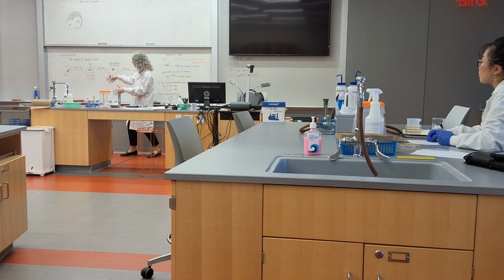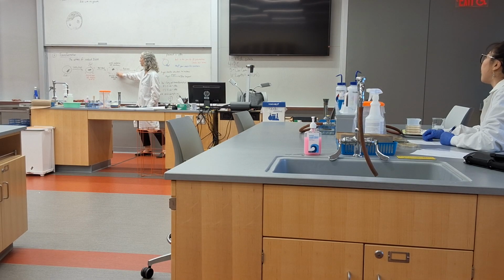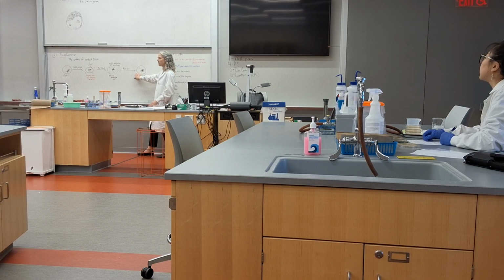Okay, so we heat shock the cells, the plasmid can enter at that point, and then we allow the cells to recover, because this was a traumatic experience, right? Like suddenly being exposed to that warm temperature and having those micro tears. So then we have to leave it at room temperature for a little bit to let it recover, and then we put it on agar to grow.